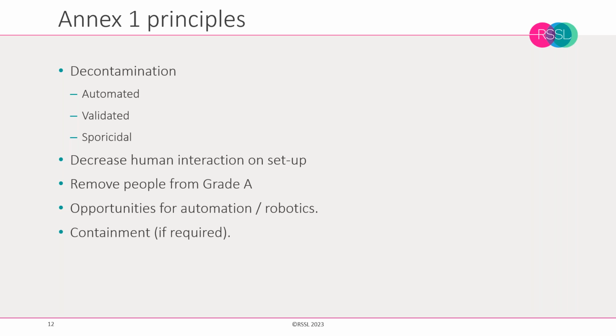Isolators also decrease human interaction on setup. They take people away from grade A. They also have opportunities for automation and robotics. And if we're handling certain materials, we have the opportunity for containment as well.